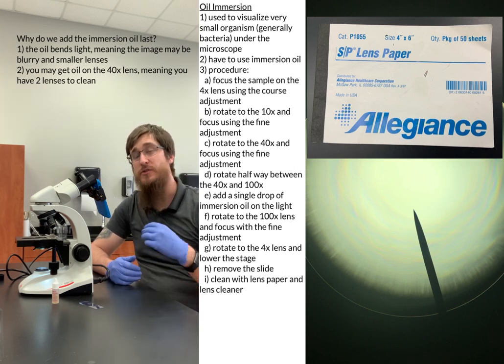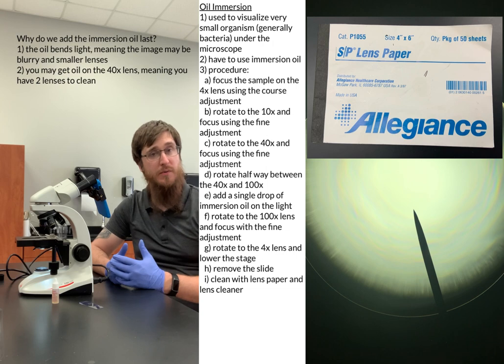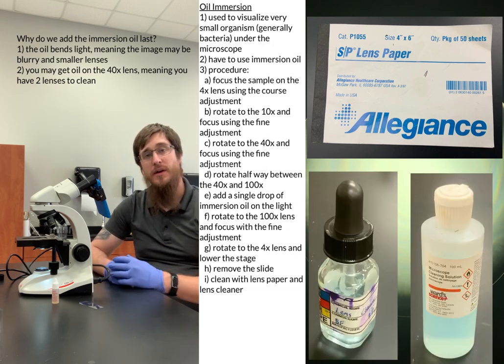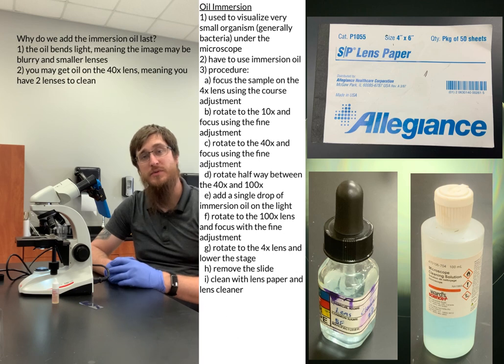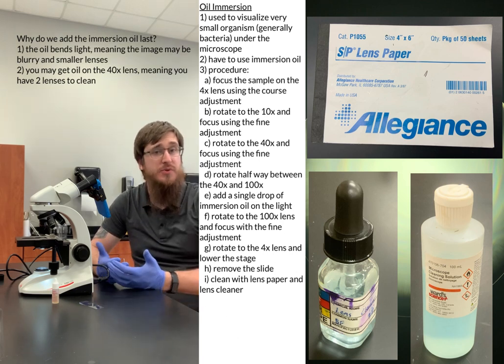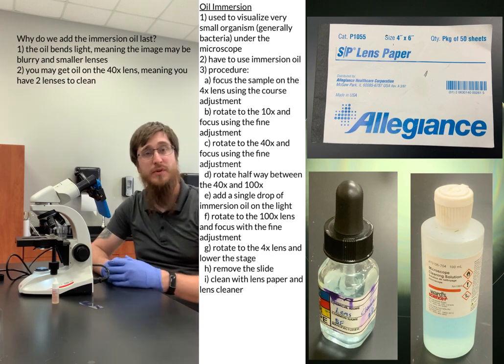We do generally also put a little bit of what we call lens cleaner on it. It's just this tiny little blue solution here. And once you've cleaned up the microscope, then you can store it and put it away. But really, that should cover how you do oil immersion on a microscope.